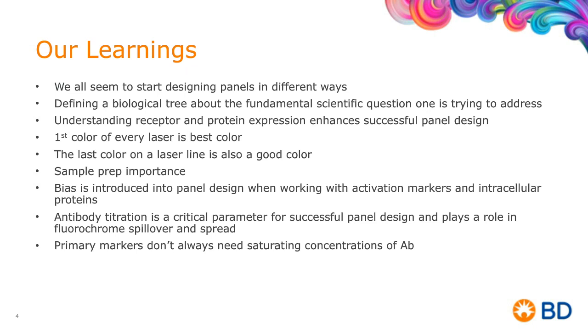And we should take advantage of those, even if that flow cytometer that we're using is in our own labs and not in a core, finding those individuals that have such great experience, they can help you in your labs too. So that's a critical component of great panel design, because at the end of the day, if the instrument's not set up correctly, then it's hard to get the greatest information out of any given box.